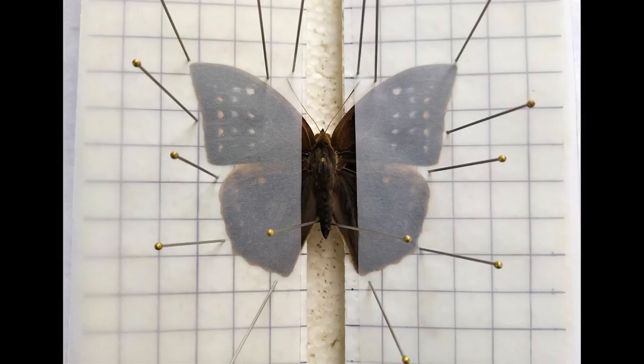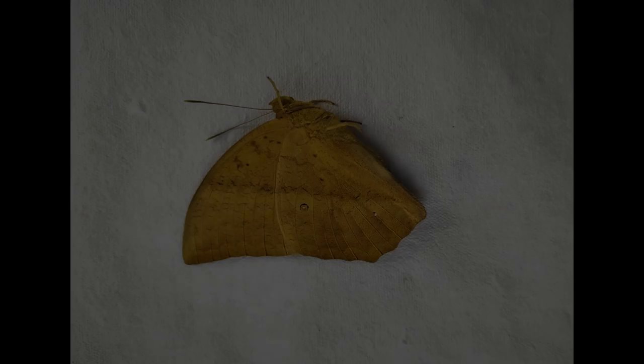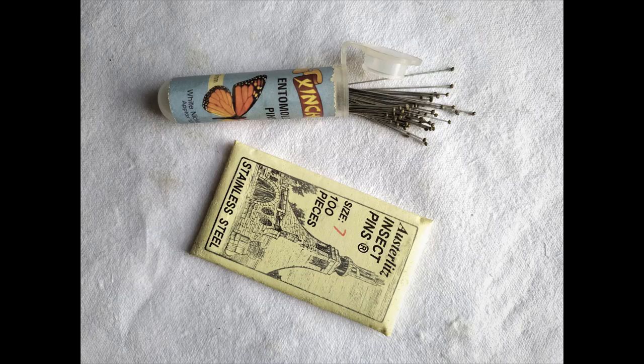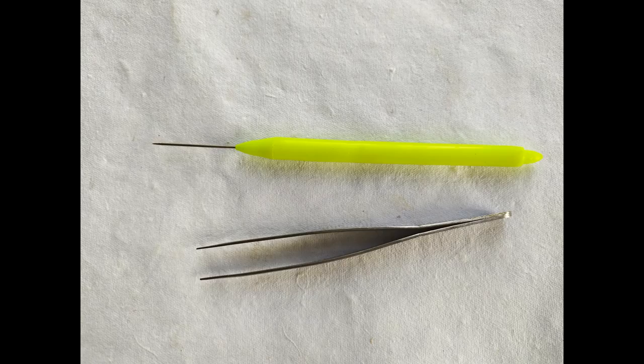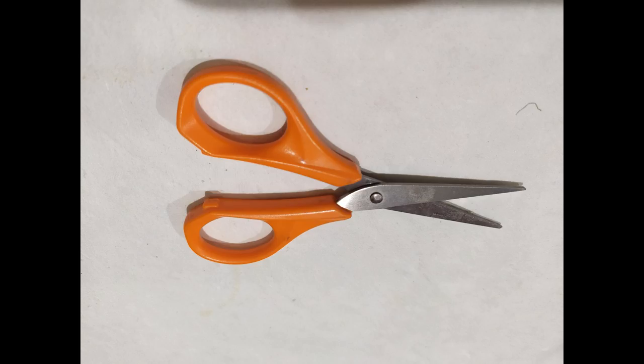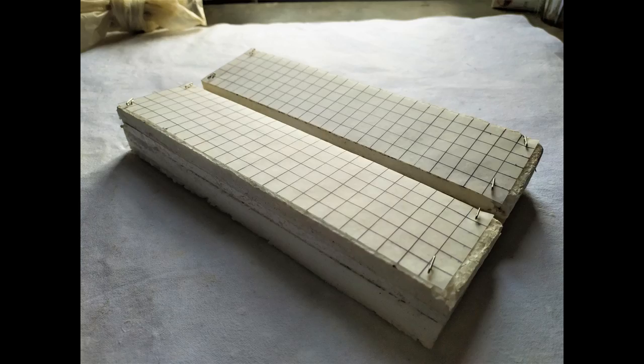First off, gather the materials required for this: a butterfly specimen, which may either be a freshly caught or a rehydrated specimen; insect pins; tweezers and pins; butter paper strips; and scissors. Gather a spreading board, optionally with grids drawn or printed on the board surface. You can use a ready-made wooden spreading board or make your own from styrofoam like the one shown in this photo.